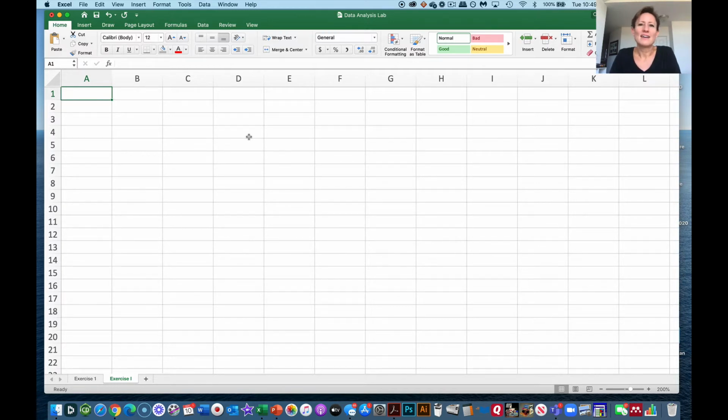So again, we did these all sort of out of order here. The basic biochemistry techniques lab will examine methods of spectroscopy. Right now in this lab and using this Excel workbook, we're basically going to be focusing on how we analyze data that we obtain from spectroscopic methods. So how is this relevant to biochemistry? We're actually going to be obtaining data that is from a Bradford assay.